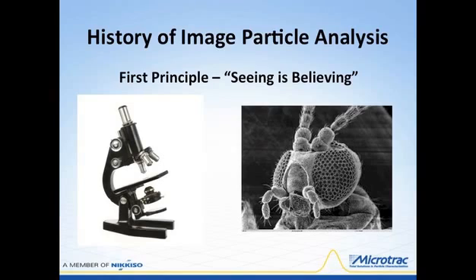Many individual samples had to be measured to get a representative result, and one analysis could easily take all day or longer.